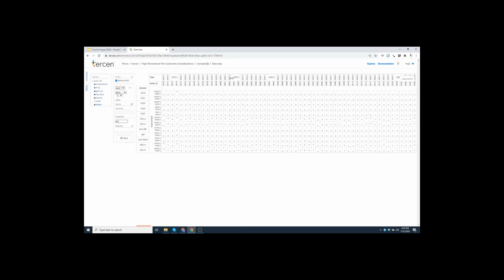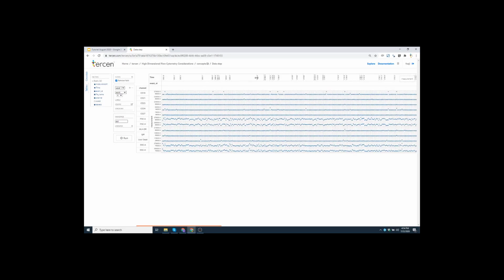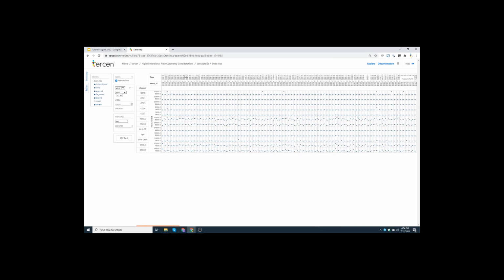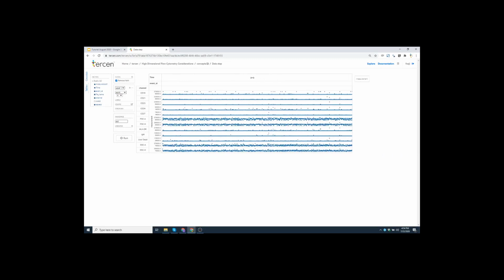So you have basically your data projected in this fashion where you have the channels, which are called the variables, on the row, and you have the event IDs projected as columns, and we call those observations, to use the stats words or the words that would be useful for you in understanding high dimensional algorithms. So the variables are on the rows and the observations are on the columns.